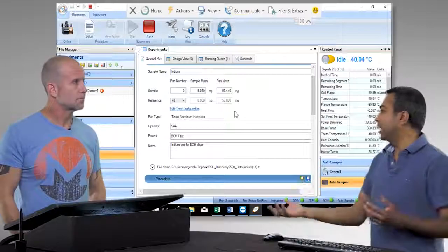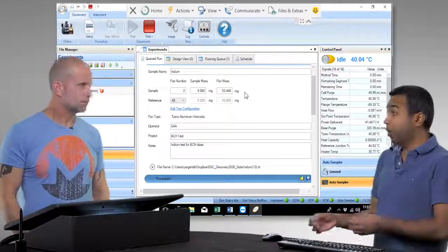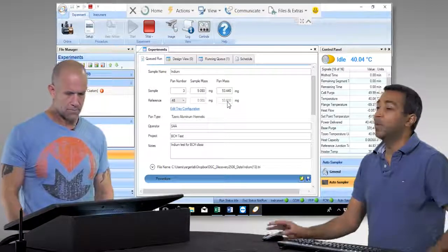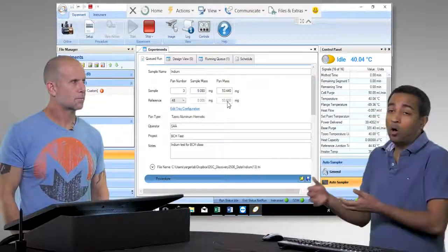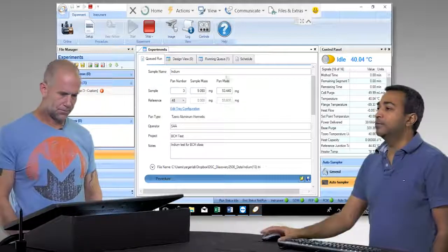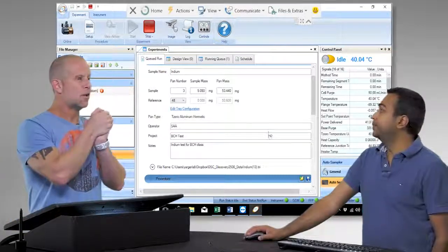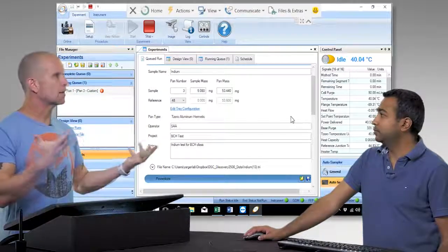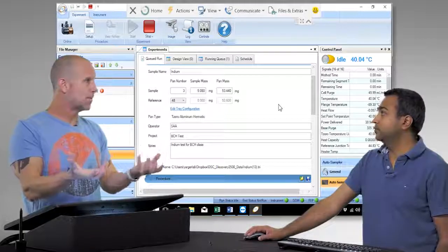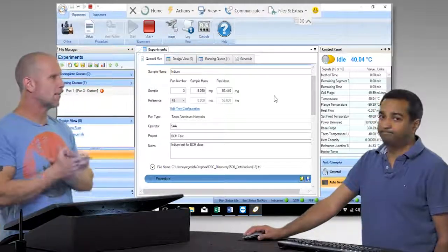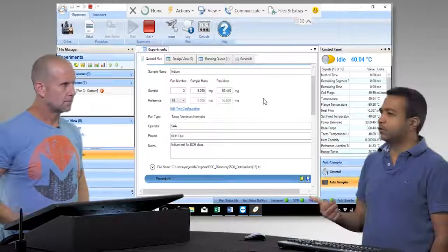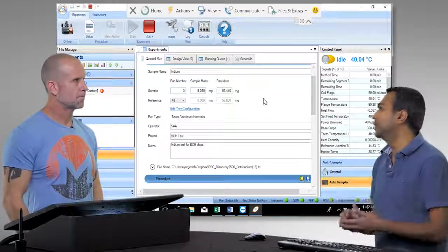This is important for certain types of experiments. For example, when you do heat capacity measurements, you want to very accurately match the weight of the sample and reference pans as close as you can. You might have a series of hermetically sealed reference pans at slightly different weights that you can pick from and match up really well. You also definitely want to match the pan type. The most commonly used are hermetically sealed aluminum pans, but there's a huge range of containers — open pans, graphite, copper, gold — and they all have certain use cases that make them more ideal.